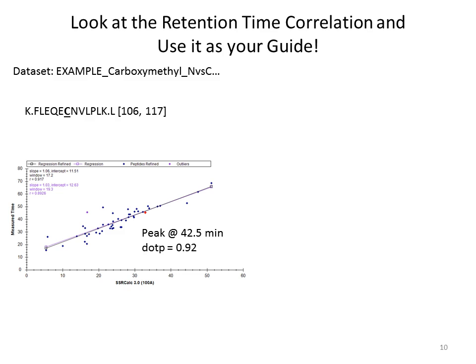It doesn't look like a great line when you first import data into Skyline, because Skyline does a great job of picking peaks, but it's not perfect. And so things that are on the periphery here, you can go in and just double check to make sure that Skyline picked the right thing. Why is retention time important? Because eventually, if you have a method that you want to use every single time, you should know where your peptide comes out, and it should come out at the same point every time. And you can even set up your method to target just those peptides when they elute, so you're not wasting mass spectrometry time.